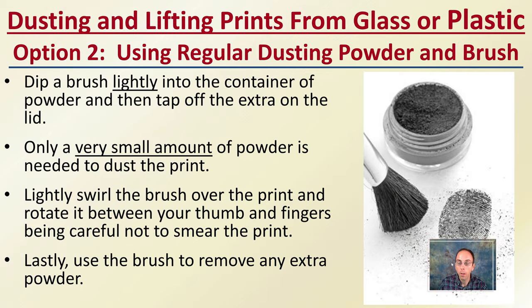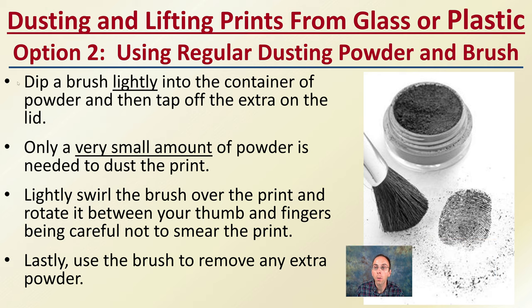Option two would be using regular dust powder and a brush, which follows a very similar method. Here, you dip the brush lightly into a container of powder and then tap off the extra into the lid. Use only a very small amount of powder to dust the print. This comes with some experience, but if you're starting out, use less than you think — that would be my suggestion. Lightly swirl the brush over the print, rotating between your thumb and fingers. Be careful not to smear the print. Lastly, use the brush to remove any excess powder you may have.